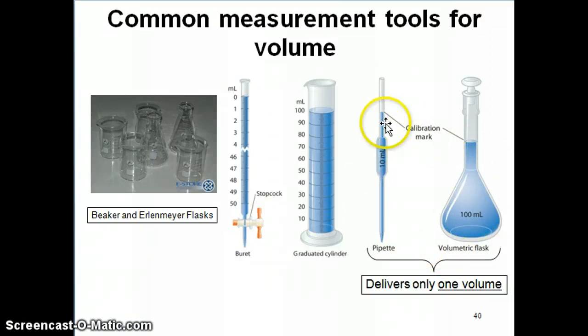Both of these deliver only one volume. So that's in contrast to the burette and graduate cylinder, which can deliver many different types of volumes. So, for example, I can measure 60 milliliters or 55 milliliters with the graduate cylinder, but I can't do it with these instruments or these glasswares because if you have a 10 milliliter volumetric pipette, it would only allow you to deliver 10 milliliter. It's not going to allow you to deliver 9.5 or 8.2 or any other volume.